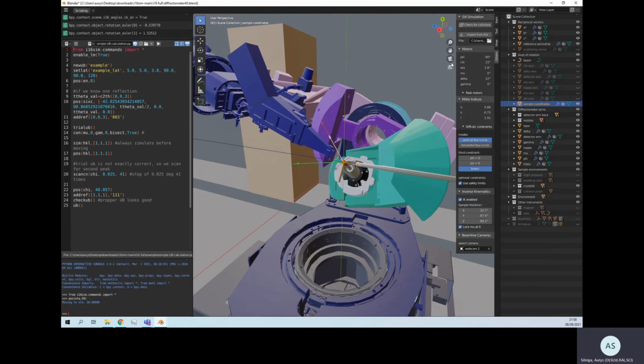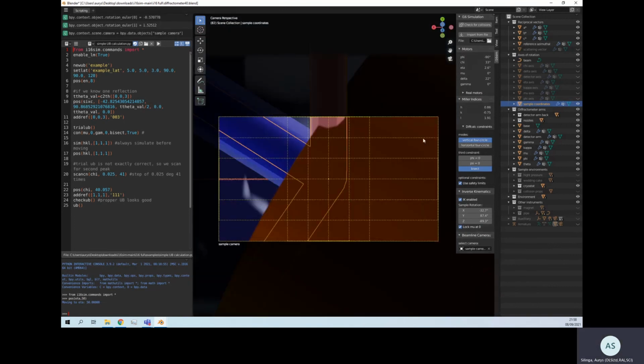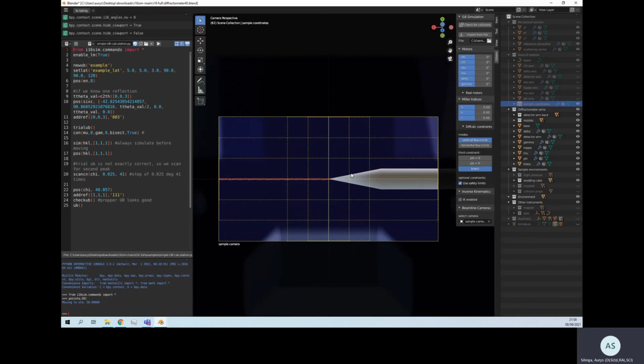And there's the beamline cameras as well. We can view as we would from one of the webcams, or the sample camera. Doesn't look like much. Let's disable our reciprocal lattice vectors and axis of rotation, go to a fairly standard position, and we're seeing the sample holder from the side. Looks much nicer if we view it as the pin.